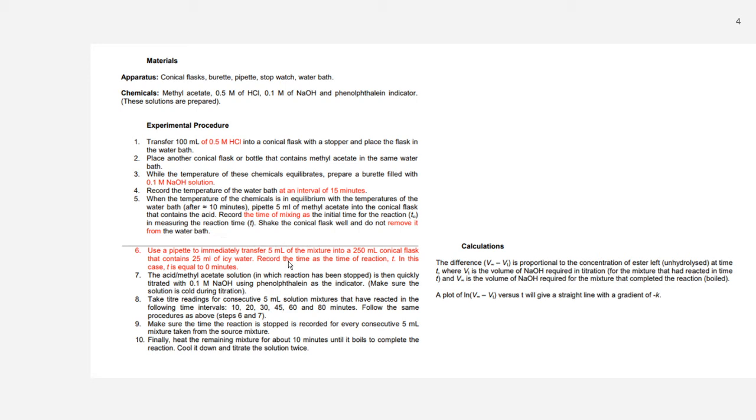So you want to actually record the temperature and the amount of acetic acid produced at a particular time. That's when you use the ice.